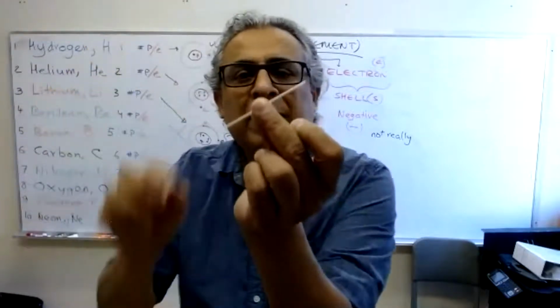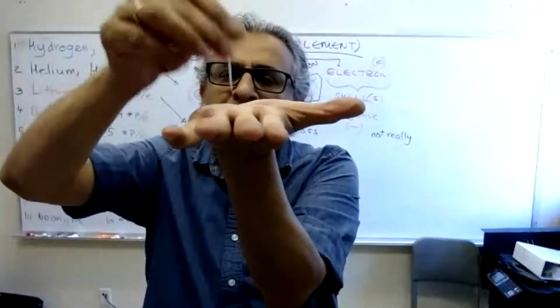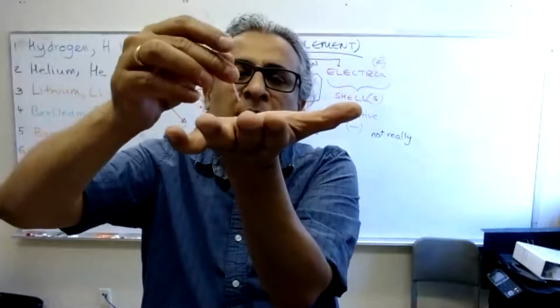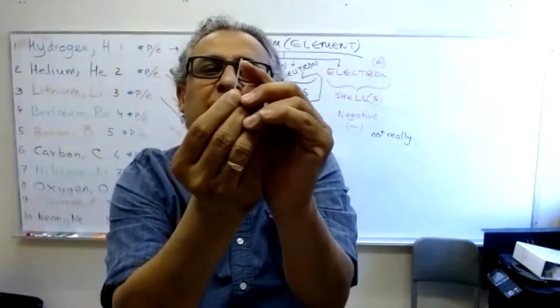This is called a melting point capillary tube. One side is open, one side is closed. You can tap it on the caffeine or whatever solid you have, acetaminophen or whatever solid you're trying to check the melting point of. You tap it there, and you get a little bit of that solid in there.